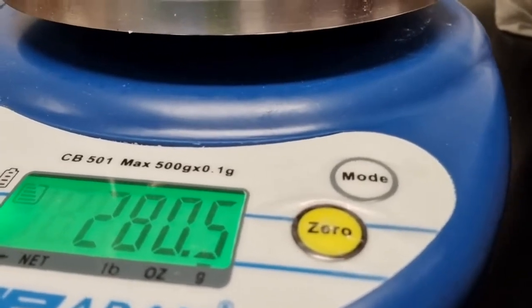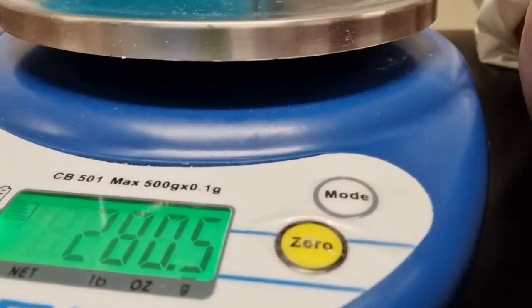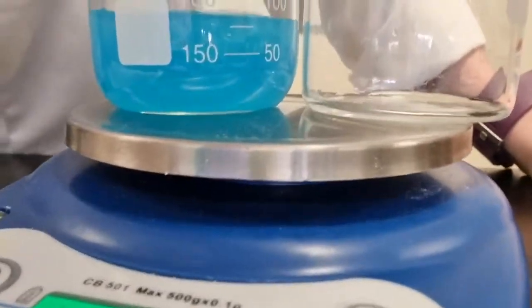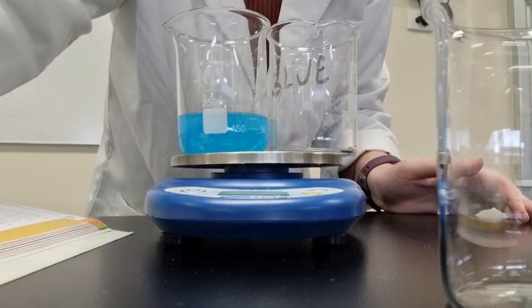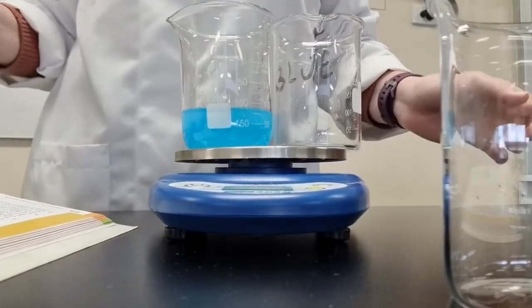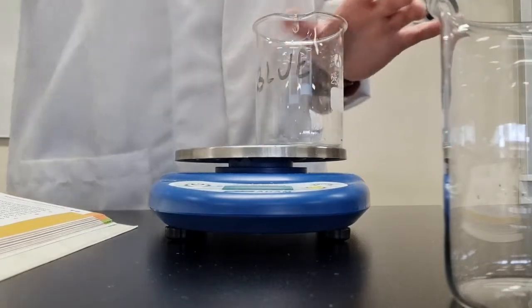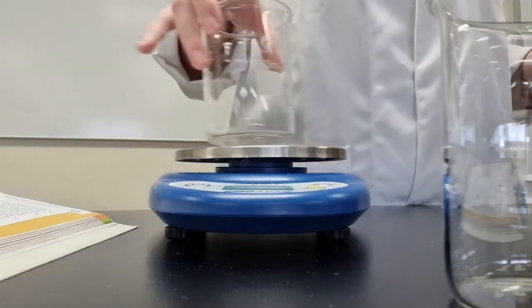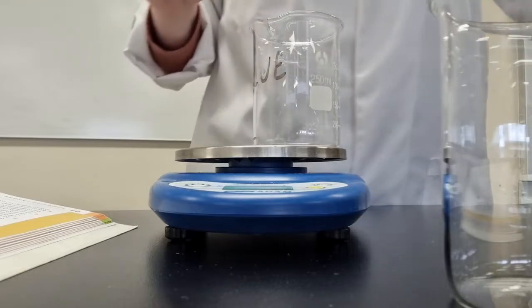208. Well, that's not what it says, so I can't read upside down. 280.5. Let me just read it up the right way, because I really can't read numbers upside down. So we can see that the mass has been conserved, even though we can see that this reaction has taken place. Okay, so I'm going to put that to the side. I'm going to reuse my blue beaker, because I'm going to put some more copper sulfate into that.